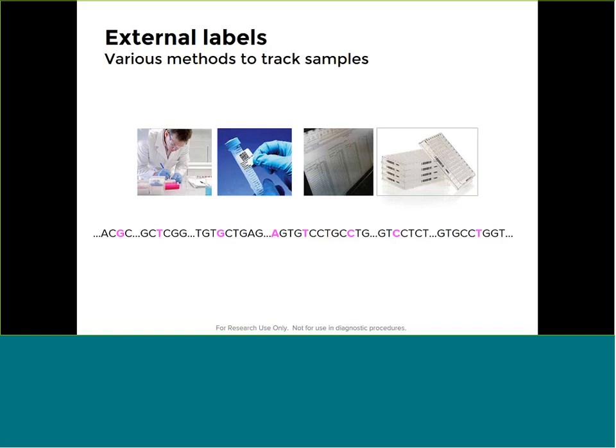The sample identification application that we're talking about here adds a critical layer of quality control and confidence to sample tracking and its movements within and between labs, by genotyping predetermined SNP targets of the genomic DNA which is present in the sample container itself. By assembling and then assessing the collective genotypes of these SNP targets, a very unique fingerprint can be created and assigned to any given sample for downstream tracking, analysis, and comparisons.